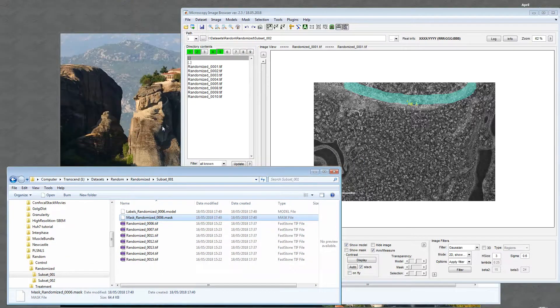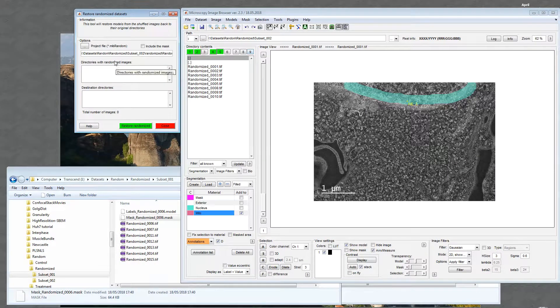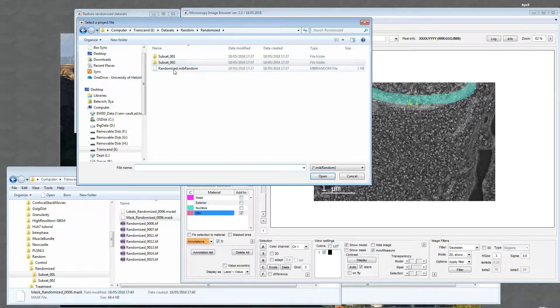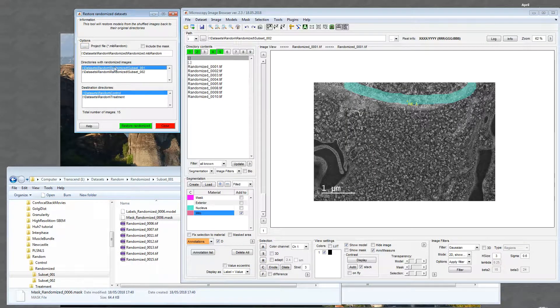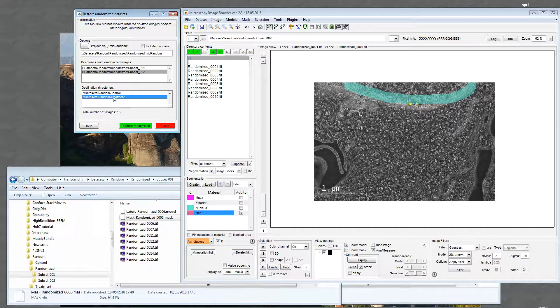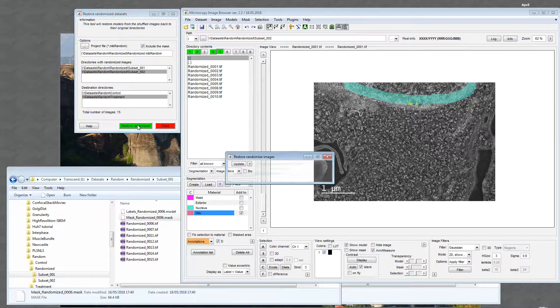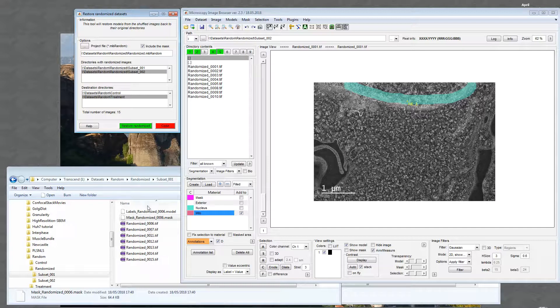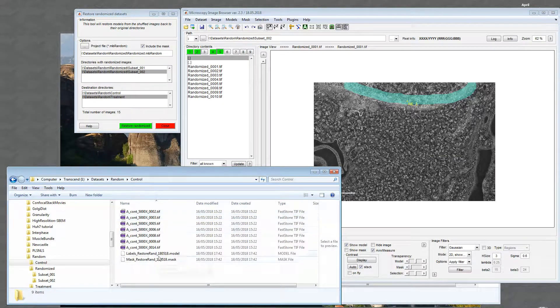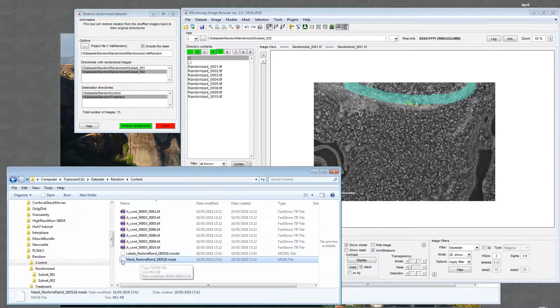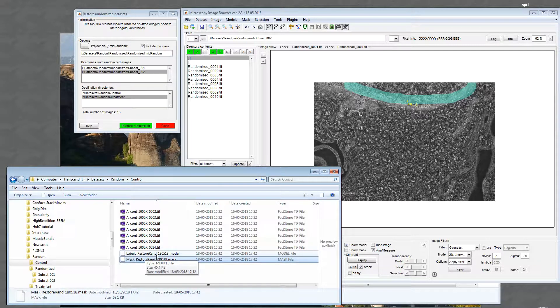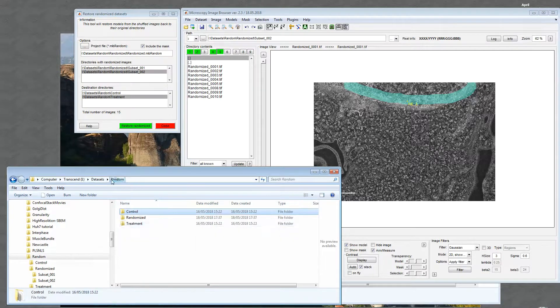Now we want to restore it back. Go to Randomize Files > Restore. First, select the project file — the MIBRandom file. When it's open, I can see the source of the randomized images — the two subsets — and the destination: control and treatment. If I have a mask I can click the checkbox to include it, then press Restore Randomized. In the original folders I'll get files named with today's date, year-month-day, model and mask, for both control and treatment.